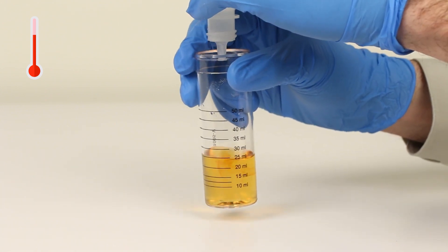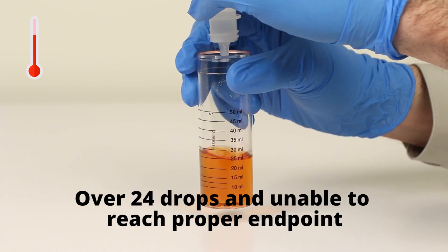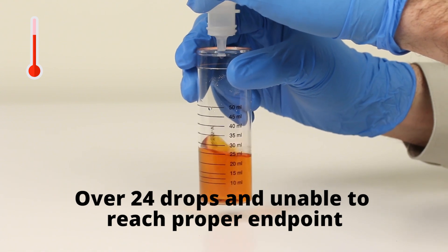You will notice that because the sample was not properly cooled, the starch acid indicator powder has degraded from blue to brown and we are unable to achieve an accurate end point.